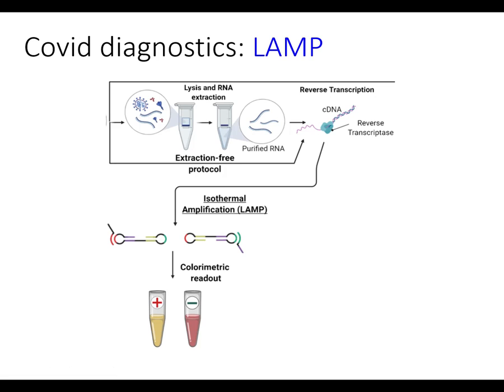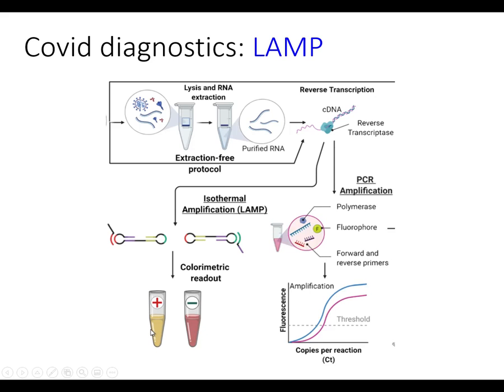This is a molecular technique, but it's taken to be a yes-no molecular technique, as opposed to the qPCR amplification, which is considered to be a quantitative technique. So this will tell you how much viral RNA you started with. This just says, did you have it or did you not have it? Now, this becomes a little bit more problematic when you're thinking about samples with low amounts of virus in it. Can you detect them? Can you differentiate them with people who don't have any virus or have lots of virus?